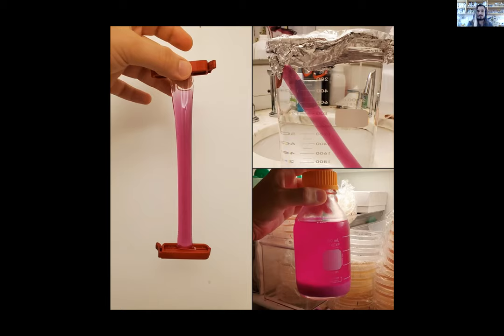So what you do is you use a chemical that aggregates the cells. That cellular aggregation breaks the density barrier, the buoyancy barrier of the cells, and they start sinking to the bottom by just adding chitosan. So you just let it settle in a fridge, and you start doing dialysis. And then I did the client prototype, and they were very happy.